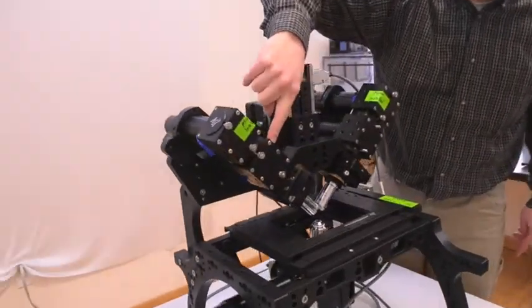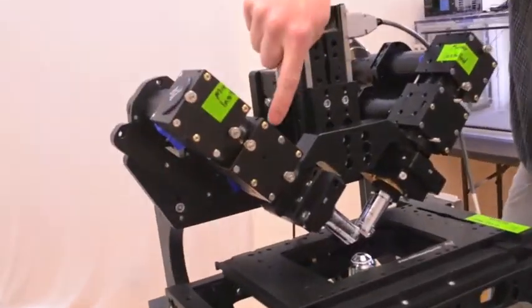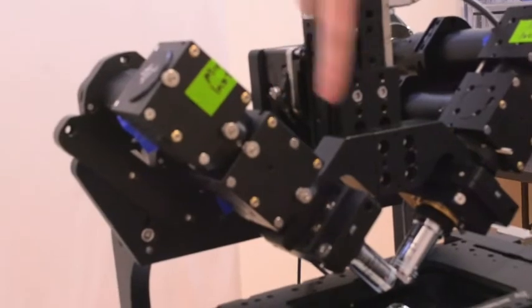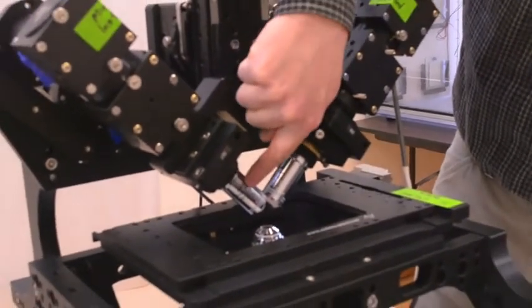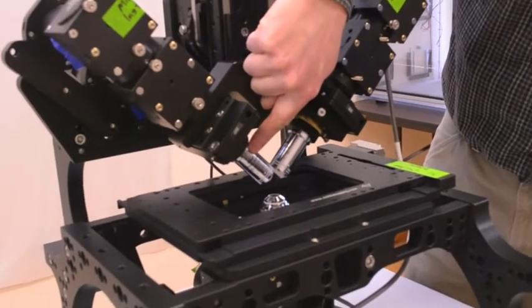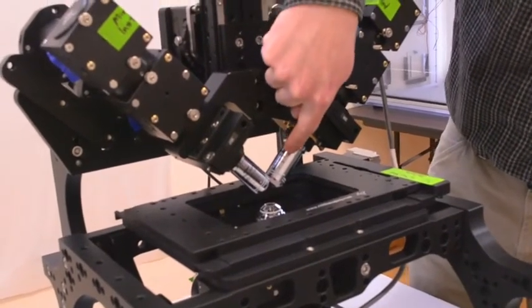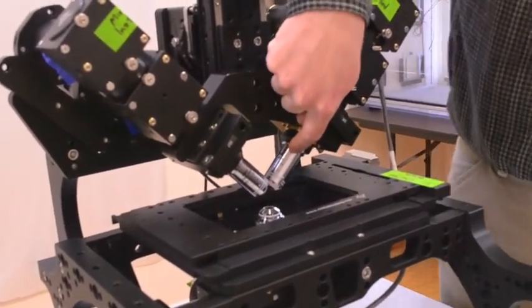So this generates the light sheet, and the light sheet is then passed through this tube lens into the dichroic mirror. It sits inside this cube, and the excitation beam is reflected by the dichroic mirror down into this objective.